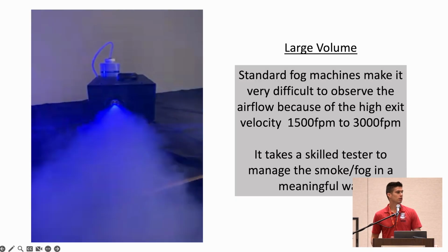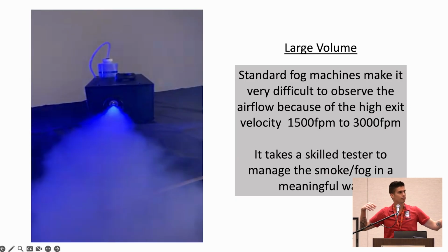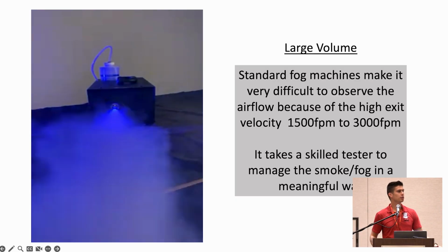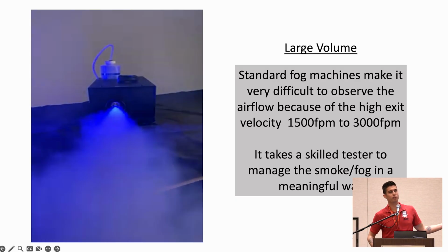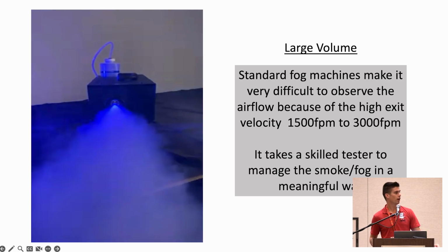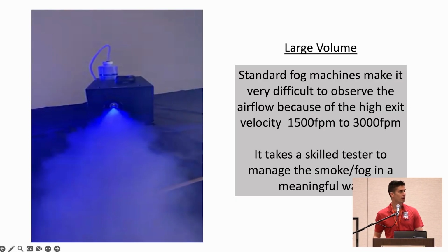When you go to the disco, they got the lights, and it's all out into the middle of the dance floor. Those things are programmed to shoot smoke further than 12 or 15 feet, and you're sitting there pointing it at the front of your sash of the hood and pushing it in there. That's not showing you if it's containing or not. That's showing you that you have a smoke gun.